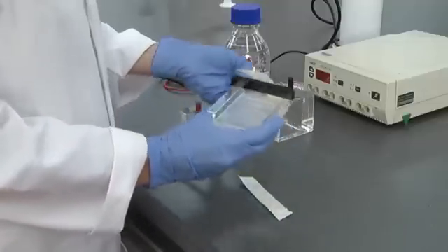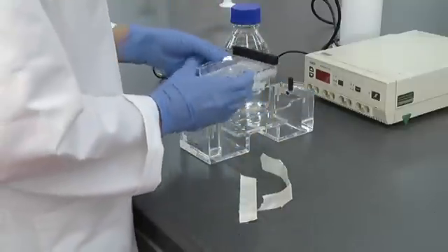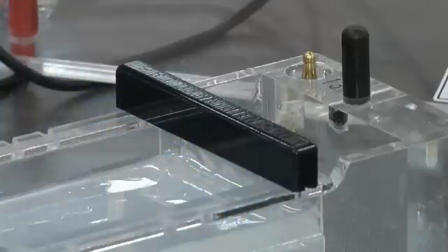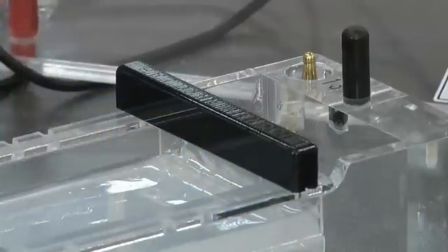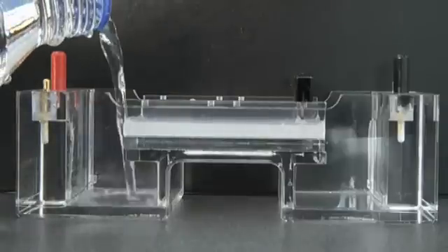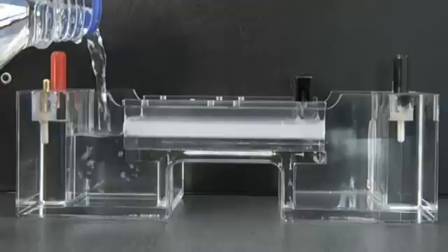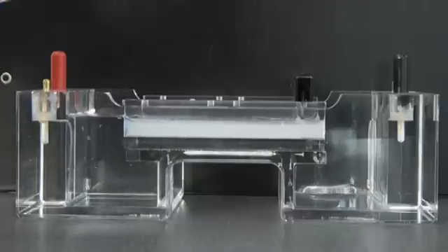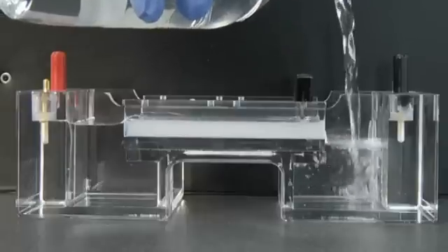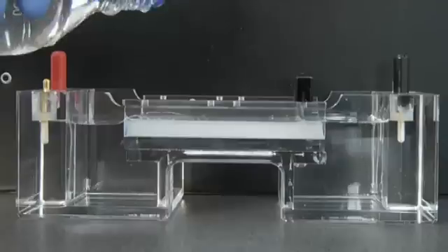Once set, remove the tape and place the gel in the gel tank. Remember nucleic acids are negatively charged and will migrate towards the positive. Therefore the comb should be located towards the black cathode end. Pour the running buffer into the gel tank to just cover the gel. The buffer level should be just a few millimetres above the tops of the wells.